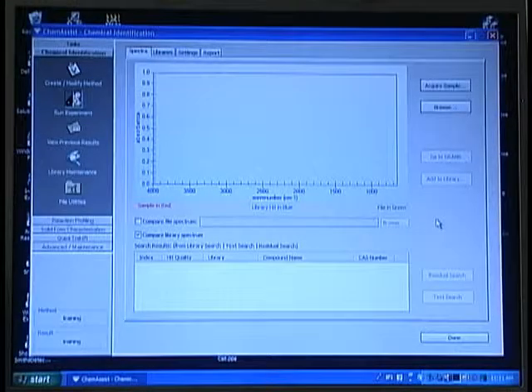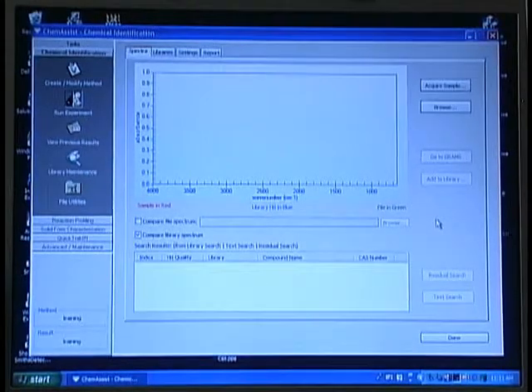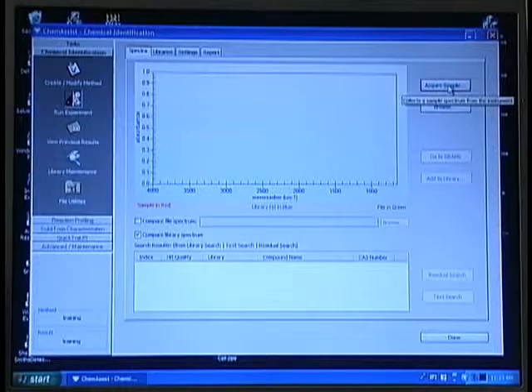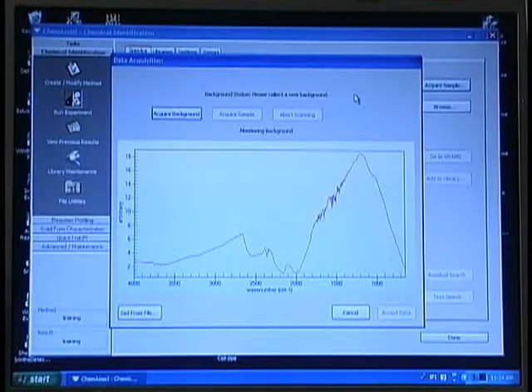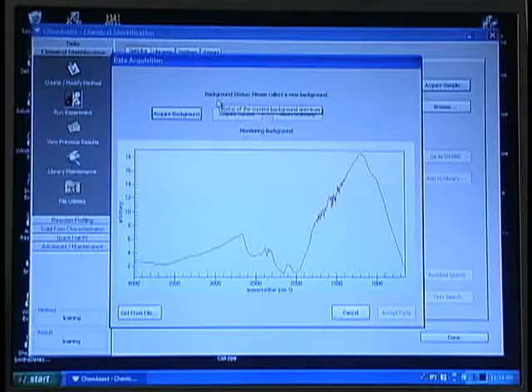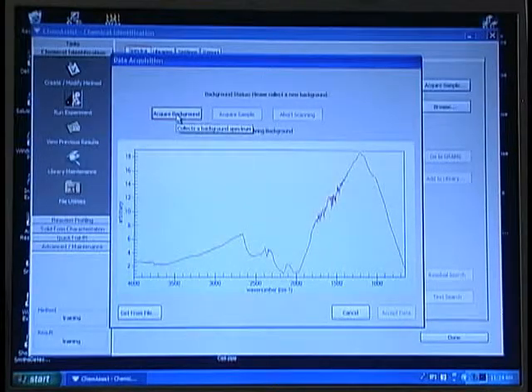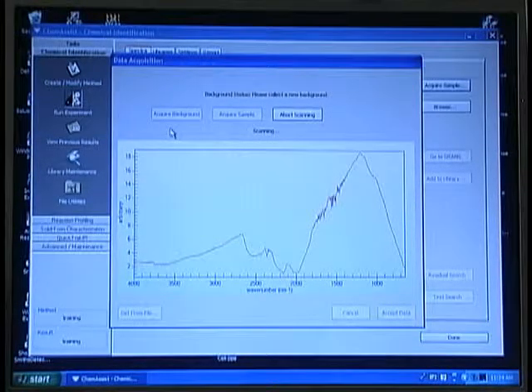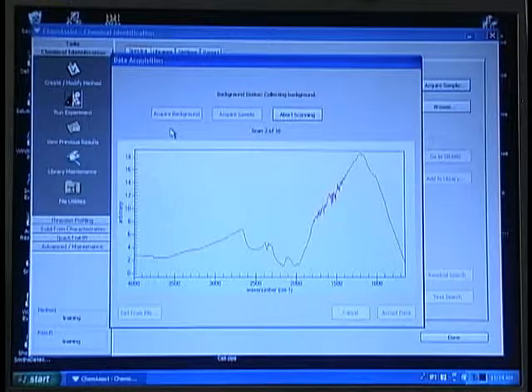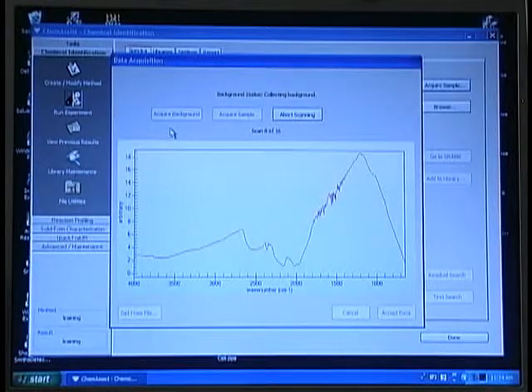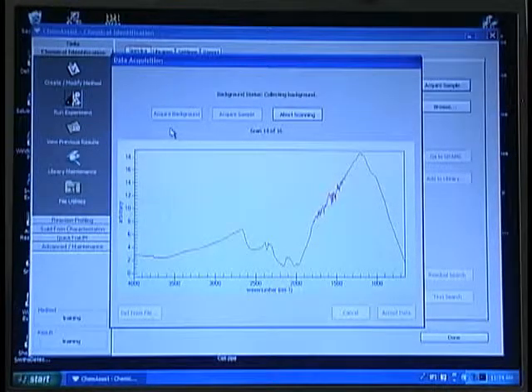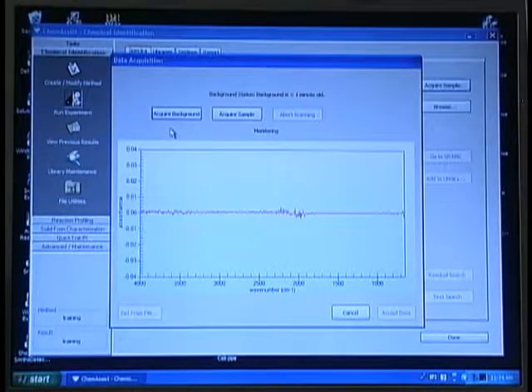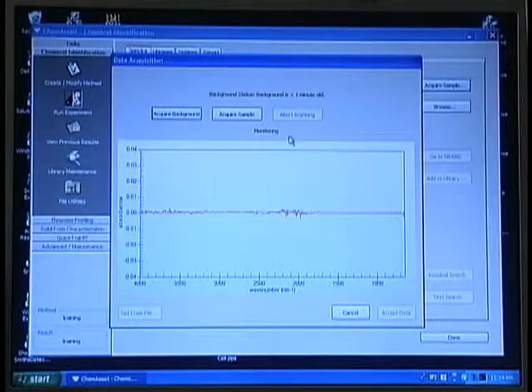At this point we are ready to analyze a sample. We begin the analysis by clicking on the Acquire Sample button, then we click on the Acquire Background button. The system will show us that it is performing scans of the background, and when it is completed it will say scan complete. We will see what we refer to as the 100% line or a zero absorbance line on the screen.